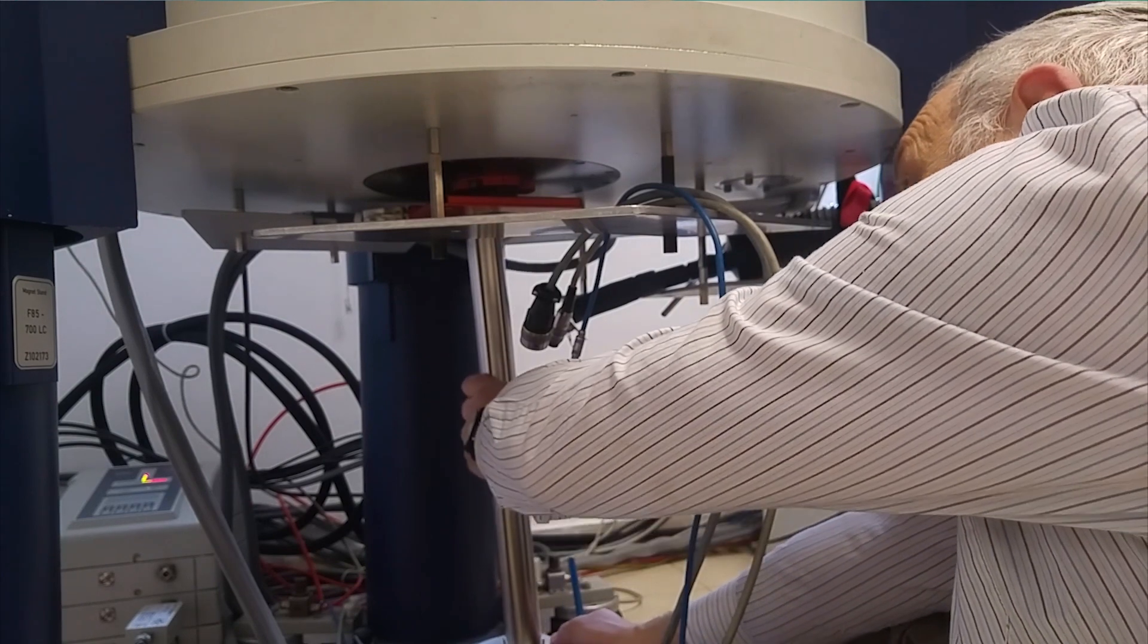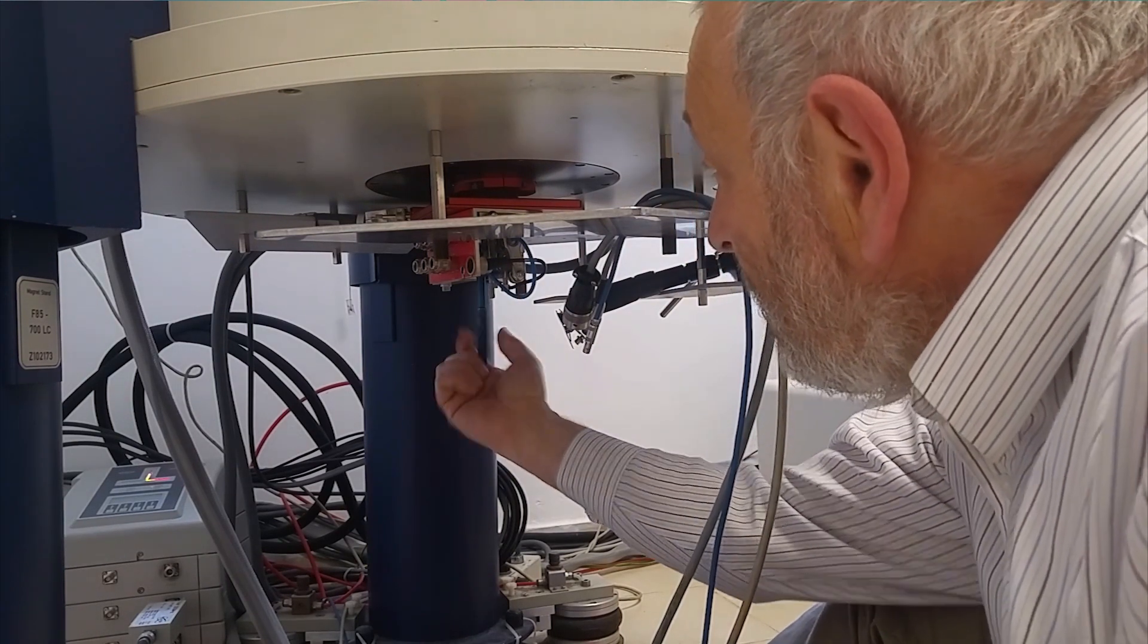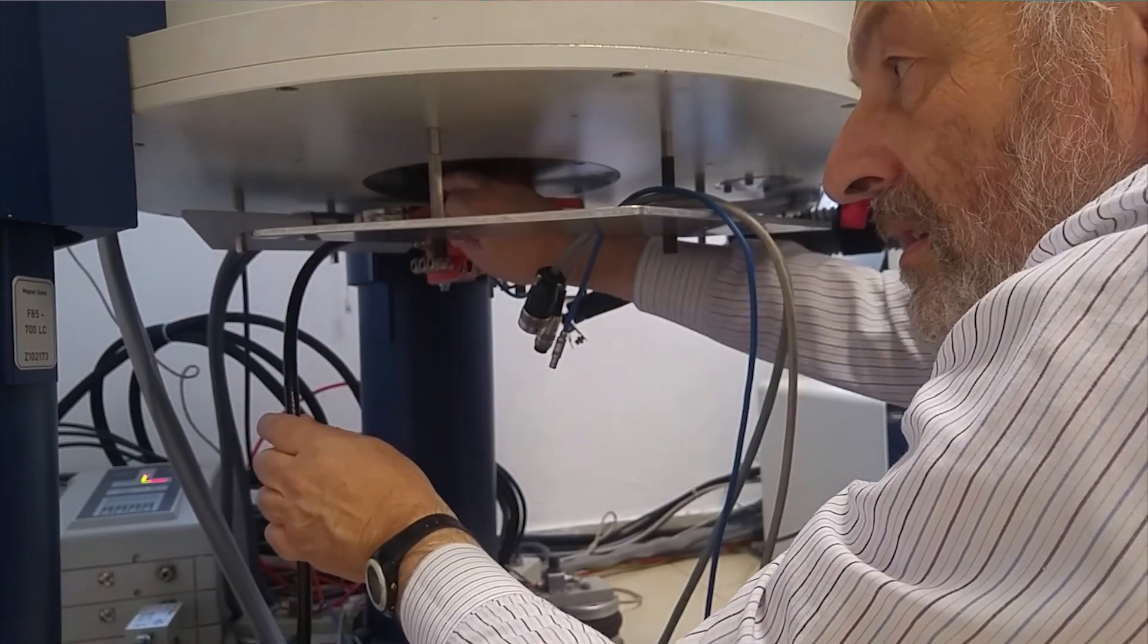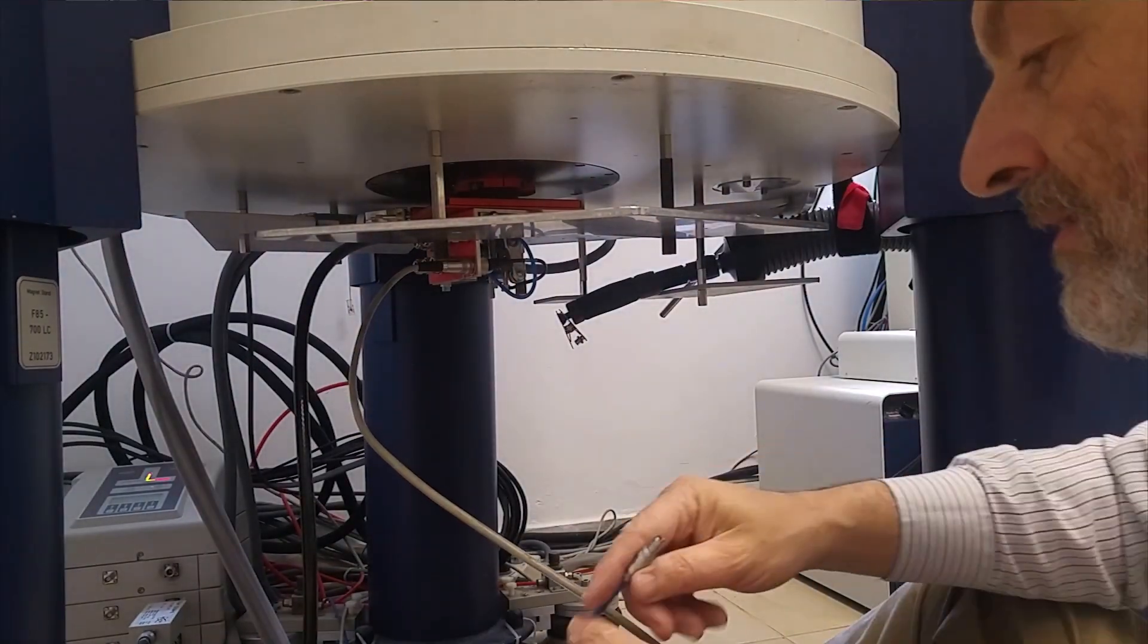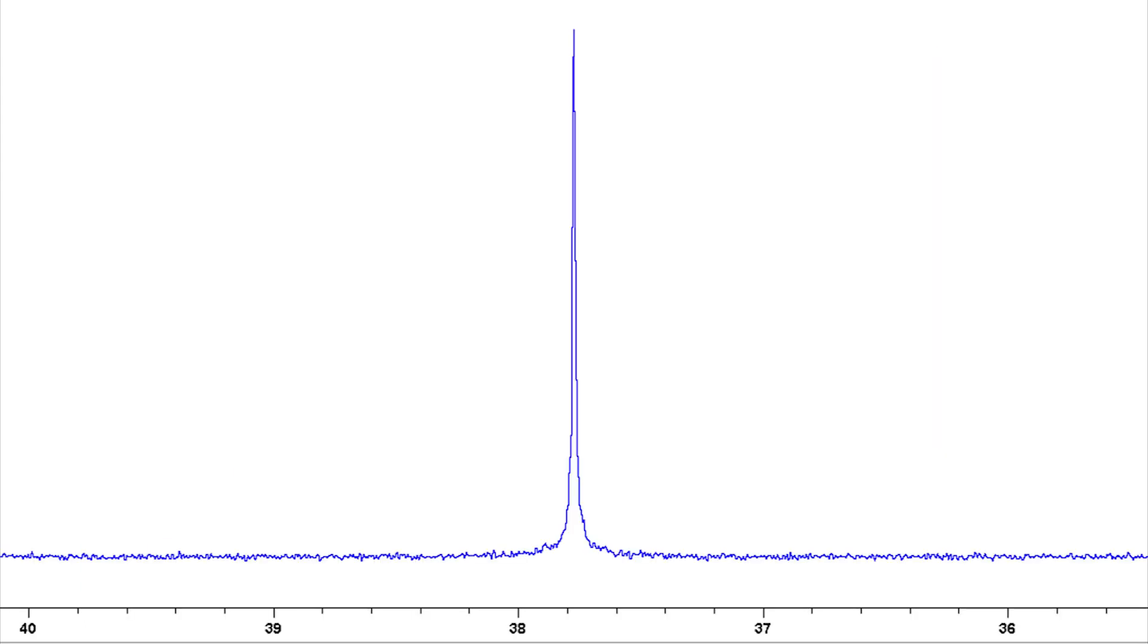So now we're going to do the calibration tests. First up was to put some potassium bromide in and check for the magic angle. So you would get the longest echoes in the FID as shown here. And then there's the turn of the adamantine sample, which we check in high power decoupling to see how good the shimming is. Check the shimming, fix the shimming and fix the magic angle maybe and the tuning.